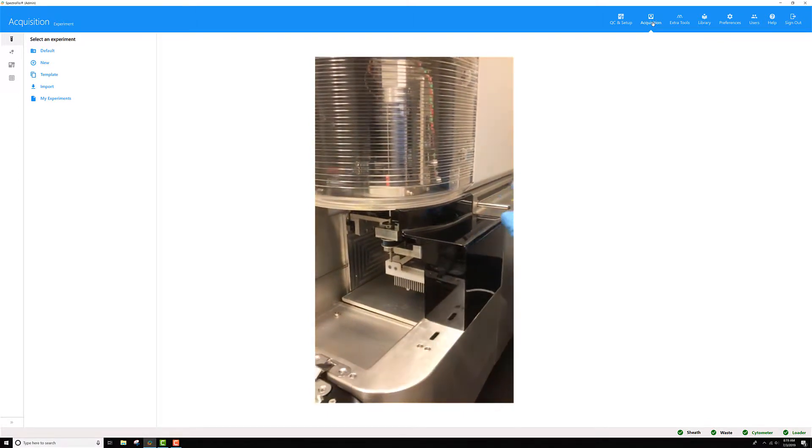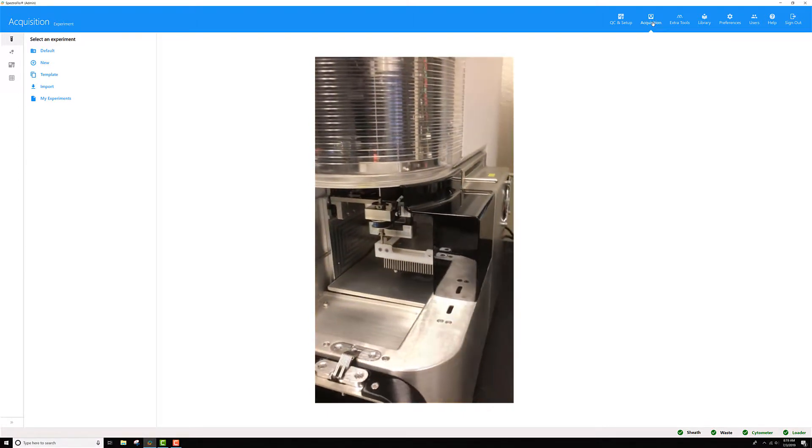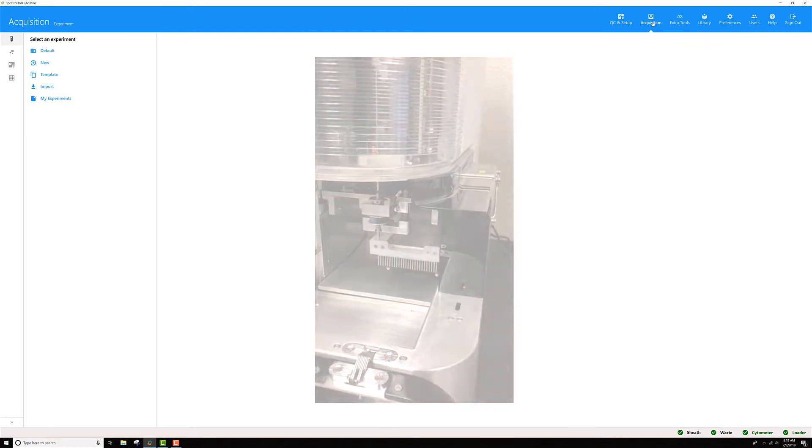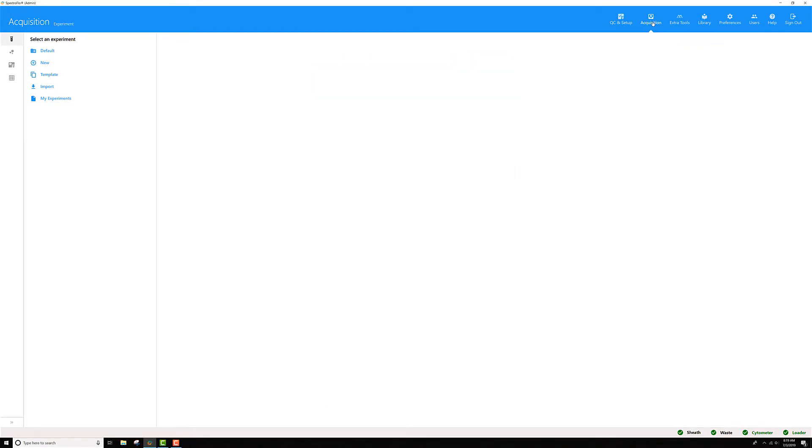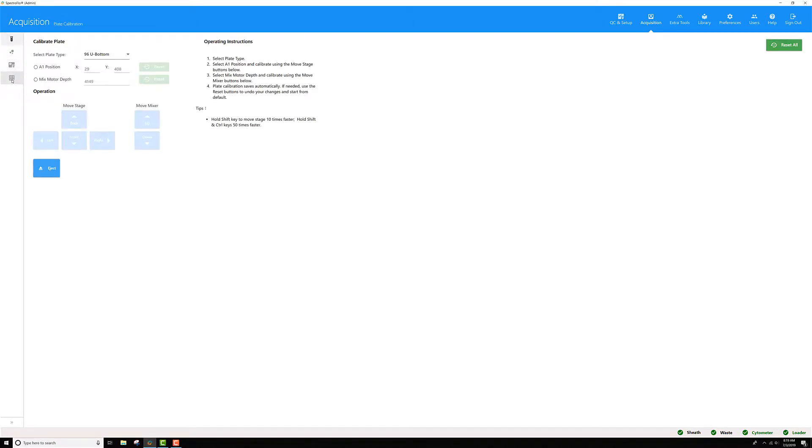Before you do that, make sure there's no tube on the SIP so you don't crack any tubes off of the SIP. Next, in acquisition, you can go to this icon here, plate calibration.